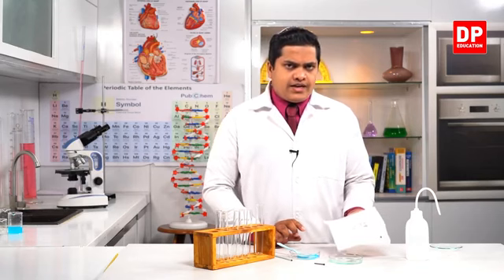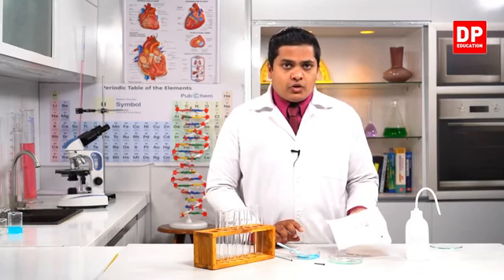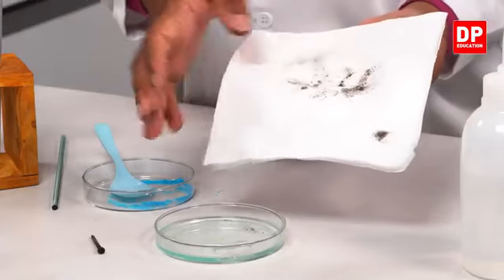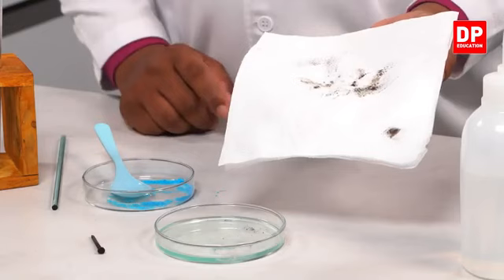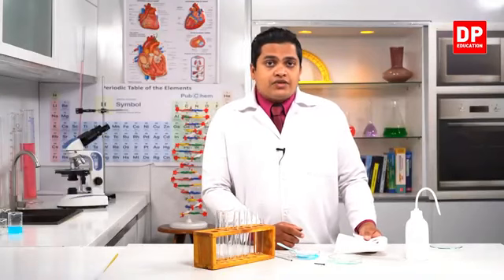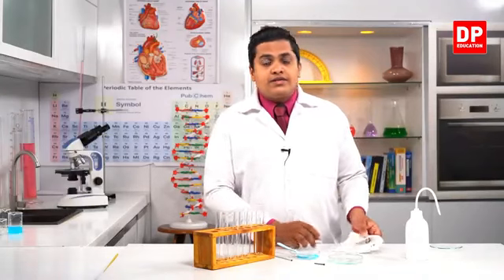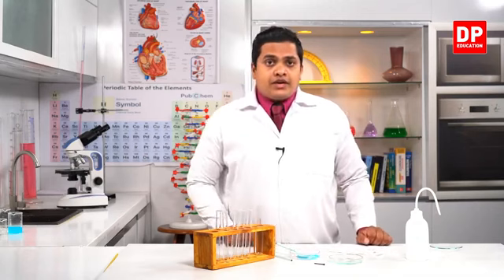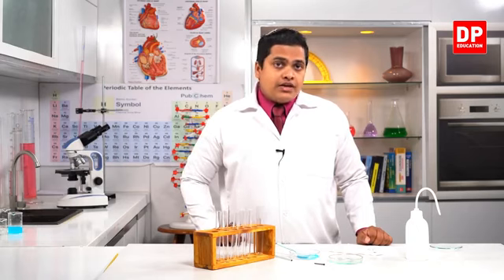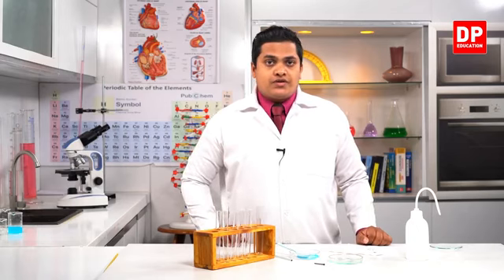So here we can say that new substances have been created. It's because in the earlier case, when we dissolved only the copper sulfate, there was no substance like this. But after adding the iron nail into the system, we can see these brown color stains around the iron nail. And also you could observe the color of the system has reduced. And once again, the temperature of the system also rose from 30 degrees to 35 degrees Celsius.